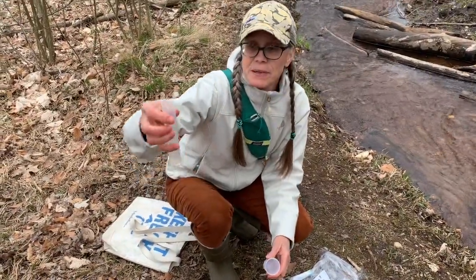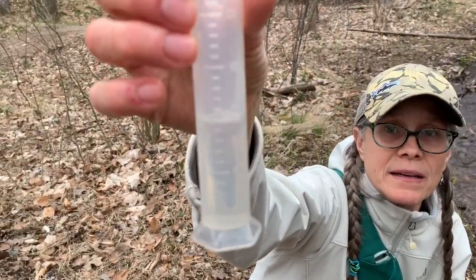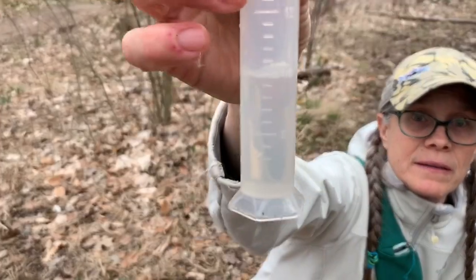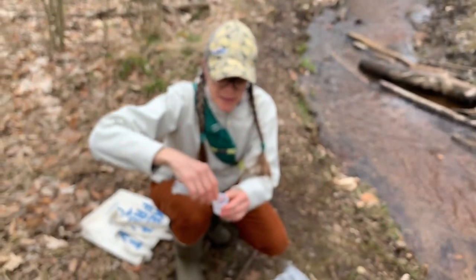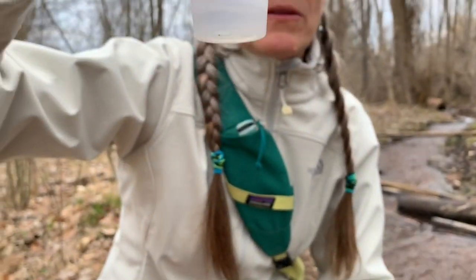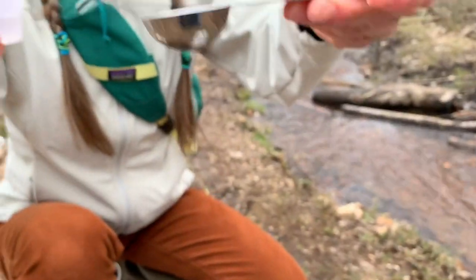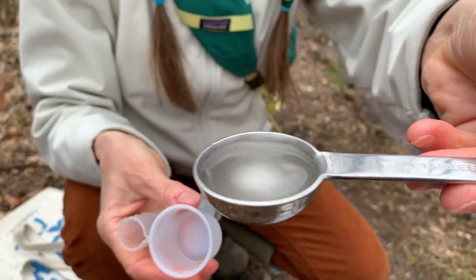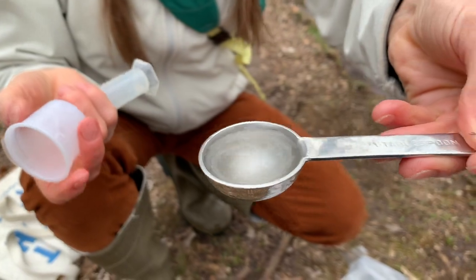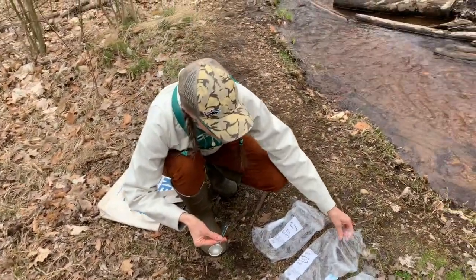So I've got 10 milliliters on there. I don't know how well you can see that. And again, I'm going to pour that into this little measuring cup here. You can see about how much water that would be in there. And then if I pour that into my tablespoon, it's just not quite a tablespoon. So you don't have to be exact in your measurements, but you want to get about that much water.